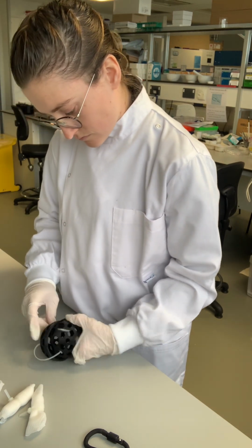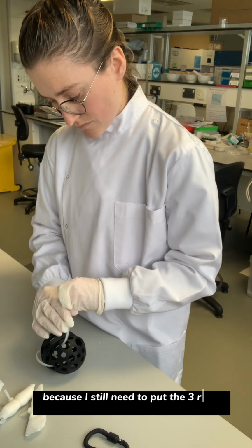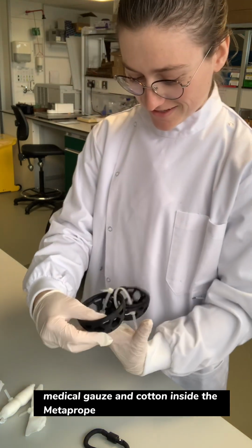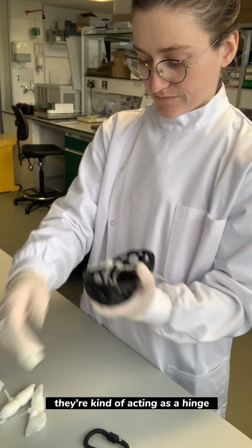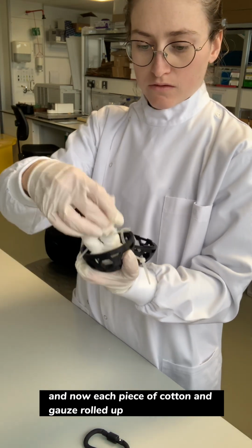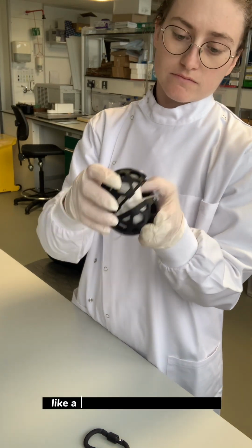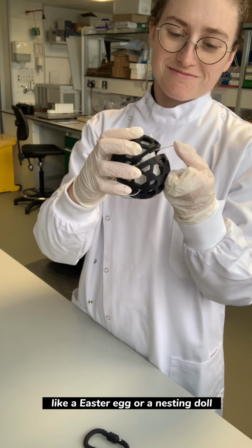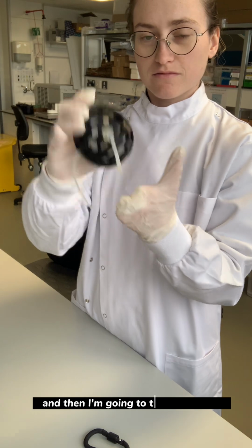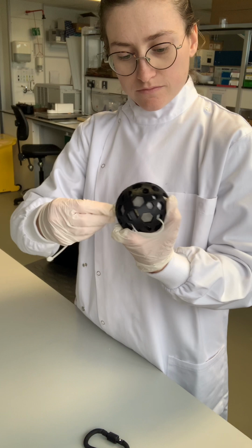This can get a bit fiddly, but again, I'm keeping them loose to start with because I still need to put the 3 rolls of medical gauze and cotton inside the Metaprobe. So I've got 2 there kind of acting as a hinge, and now each piece of cotton and gauze rolled up goes inside like that, and then you kind of just close it a bit like an Easter egg or a nesting doll. Get the zip ties to kind of go in nicely. And then I'm going to take a 3rd zip tie and secure it closed.